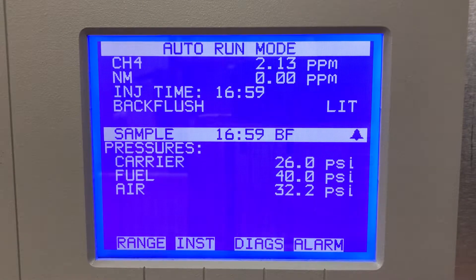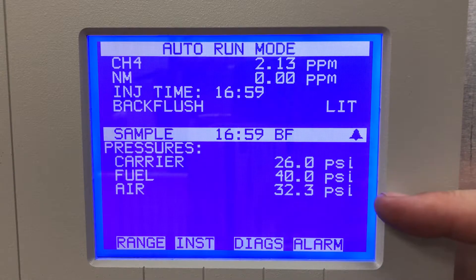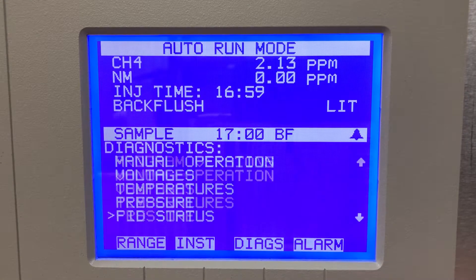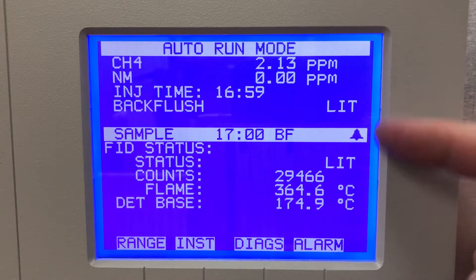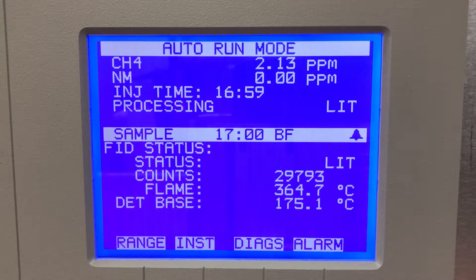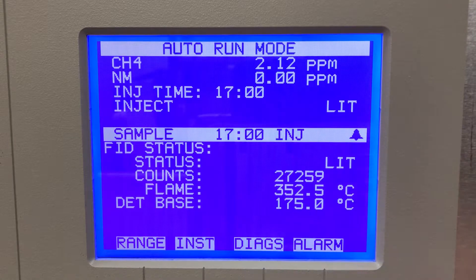Pressures — these are the cylinders I've got connected to the back of the unit. Carrier is my nitrogen cylinder, fuel is the hydrogen, and air is just for the FID. The actuator valve, FID status — this tells me if it's lit. You can see it shows it's lit, and this is the FID flame ionization detector. It tells me it is lit and shows the counts and the flame temperature as well — 364 degrees Celsius.